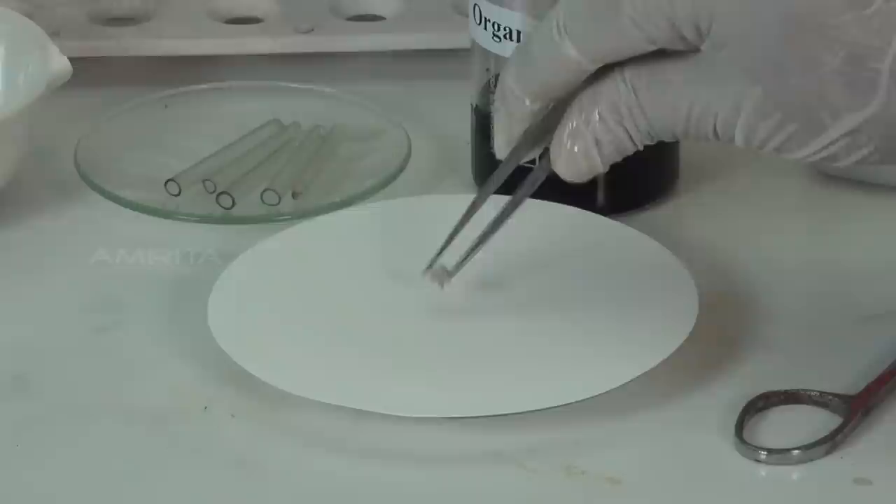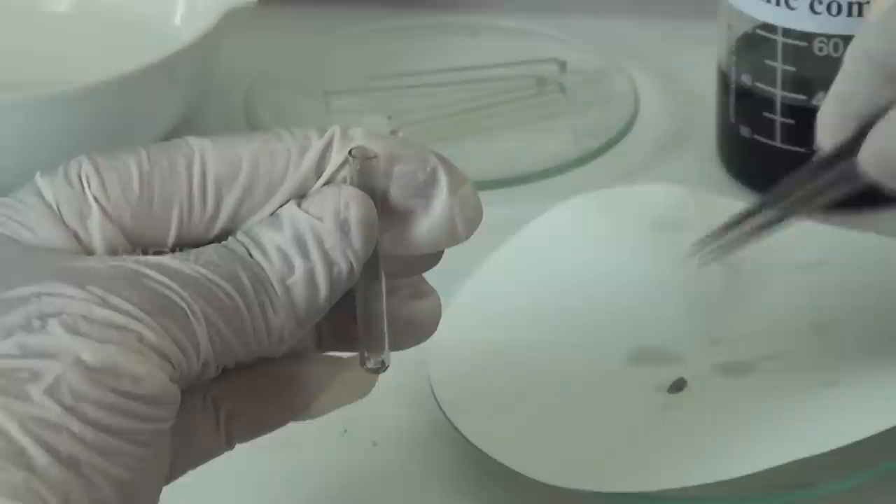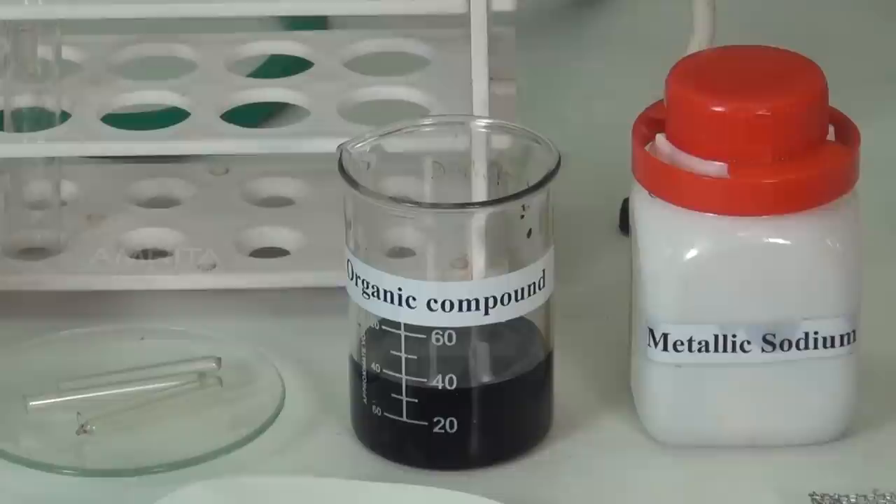Procedure: Take a small piece of sodium metal using a forceps and place it on a filter paper. Dry the sodium metal by pressing it between the folds of the filter paper. Now take a fusion tube and put the dry piece of sodium into it using the forceps. Hold the fusion tube with the tongs and heat it slightly on the Bunsen burner. Upon heating, the sodium melts into a shining globule.